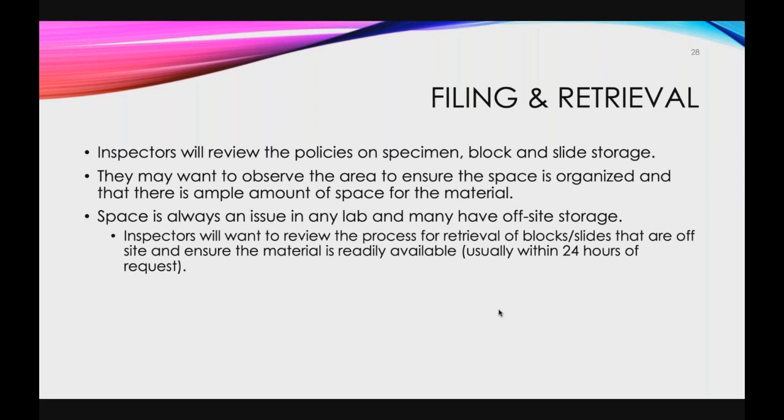Inspectors will want to review the process for retrieving those blocks and slides that are off-site to ensure that the material is readily available. Usually within 24 hours is their cutoff. So as long as you can get it here within 24 hours, you are okay.